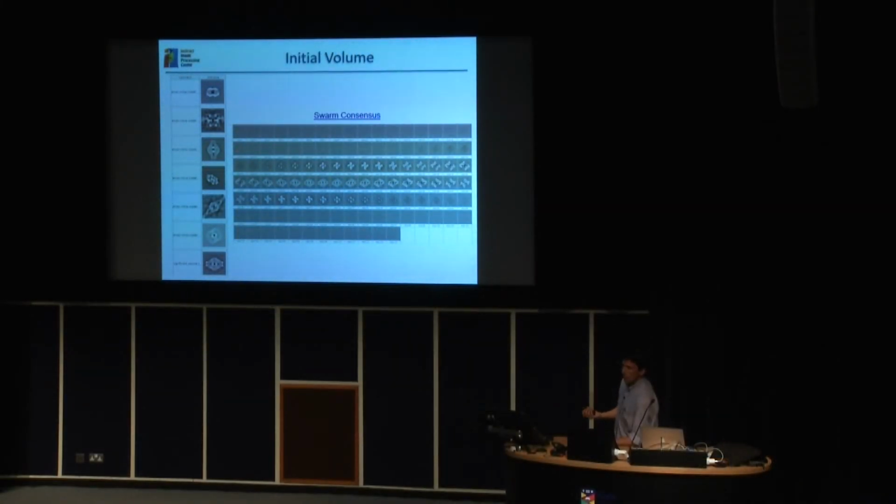So making a decision here, maybe you do the right decision, it is fine, but maybe you do the wrong decision. So you want an external opinion. This swarm consensus is an external opinion. Take all of them, make them evolve, and at the end you have this one that is a very good initial volume for your refinement.